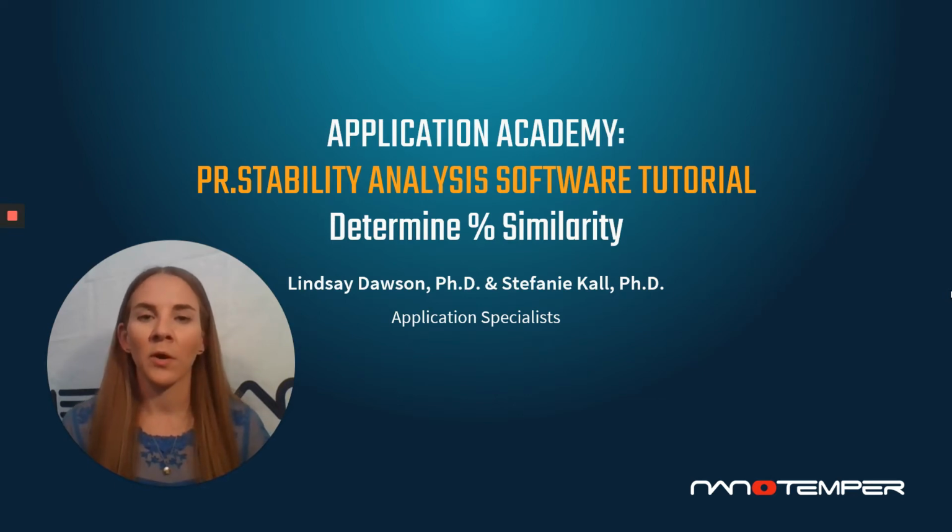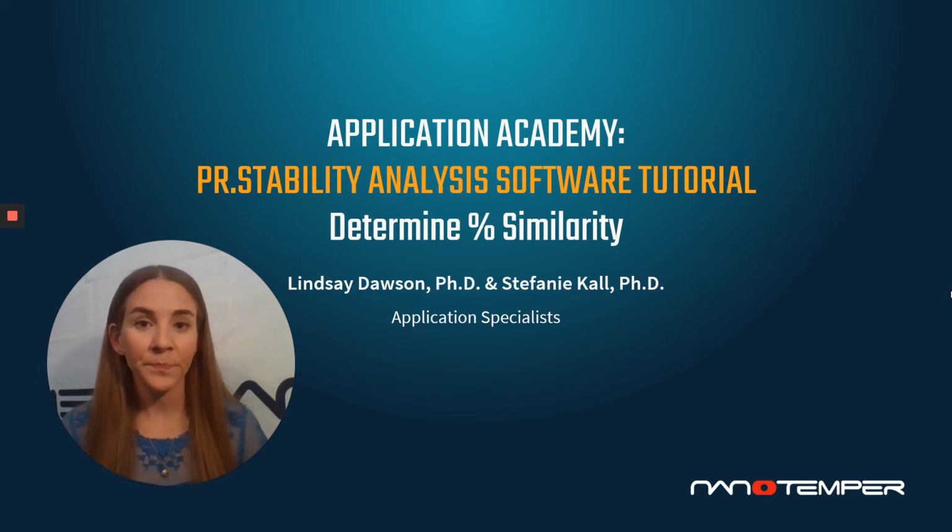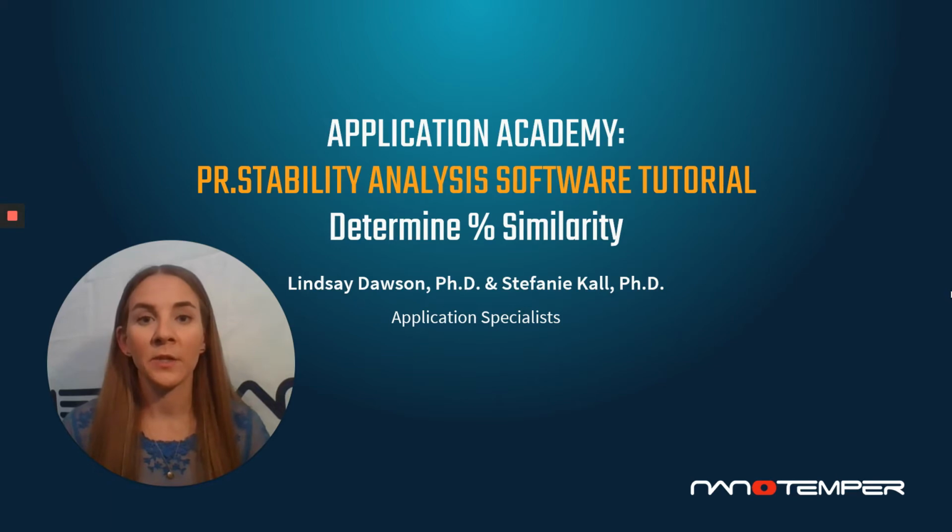This is now our similarity parameter that we're providing to you that will allow you to quantitatively analyze changes in your samples as a result of looking at changes in formulations, mutations, looking at changes in biosimilars, or even looking at batch-to-batch prep variation. Now, this parameter is giving you the ability to quickly evaluate any changes that occur in unfolding in your samples as compared to the selected reference sample. All right, let's go ahead and jump into the software and see how this works.